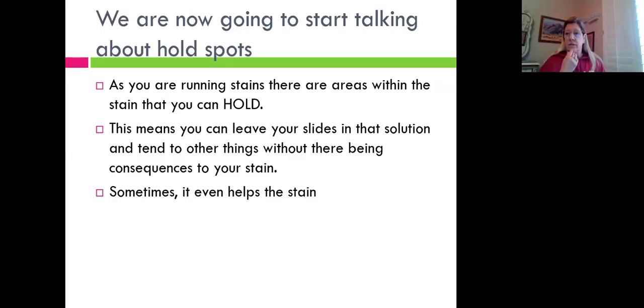Another thing that we're going to start talking about is holding spots. As you are running special stains, there are places where you can drop a slide and hold a slide in a particular solution. Most of the time that would be water. By having holding spots, you can leave your slide in that solution and tend to other things while you're sort of holding there.